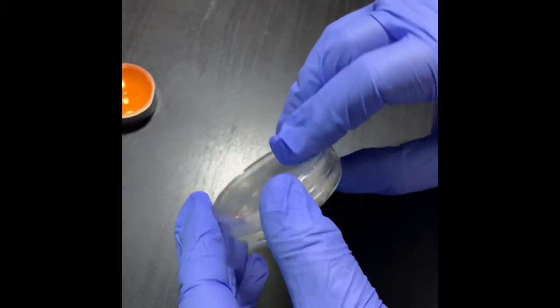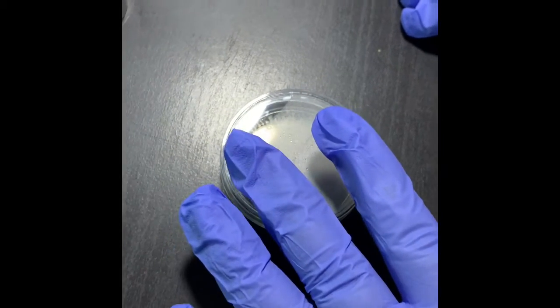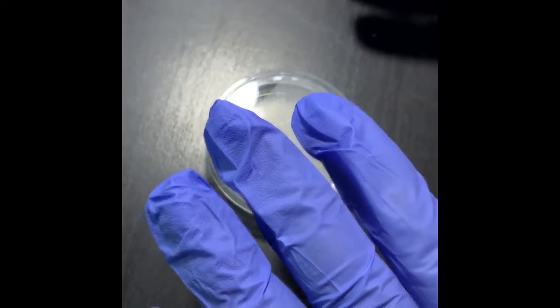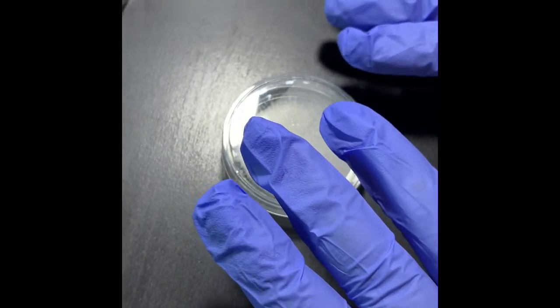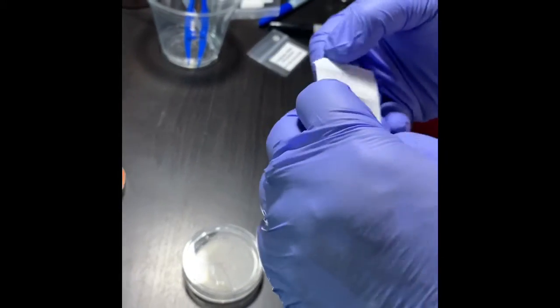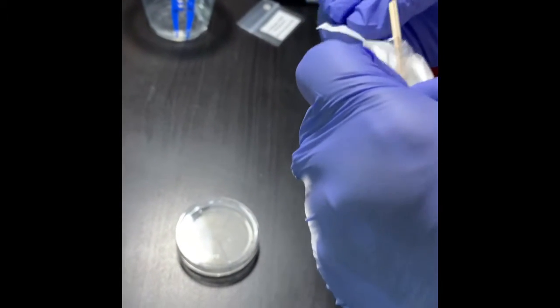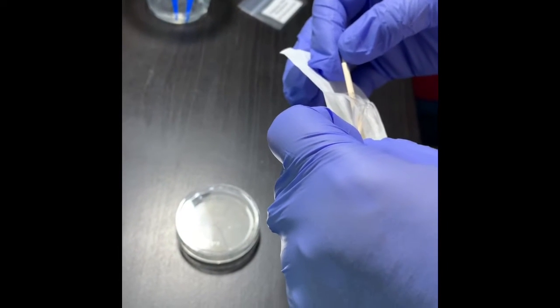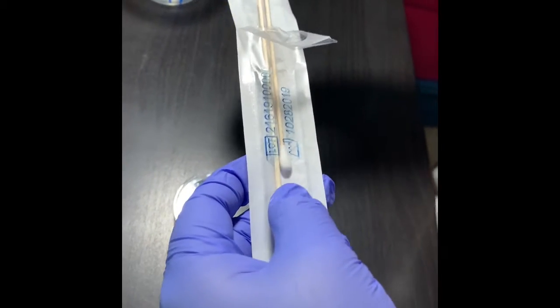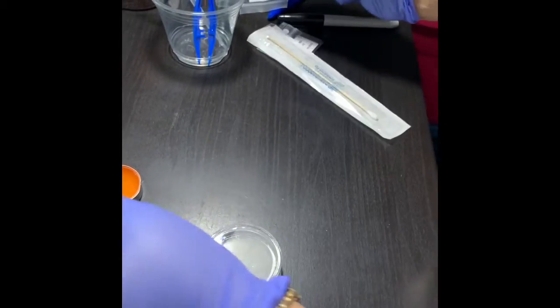Okay, what we are going to do today is make a lawn of bacteria. It is called a lawn because, like a lawn of grass, the bacteria will cover all of the agar plate. Today we are using the sample, the broth that we have cultured from our skin. I'm taking one cotton swab, and make sure that you don't touch the tip of the cotton.